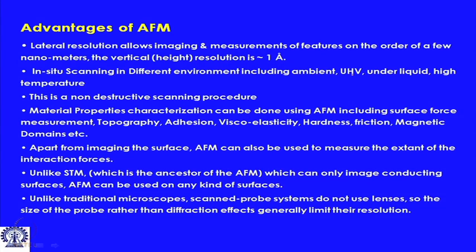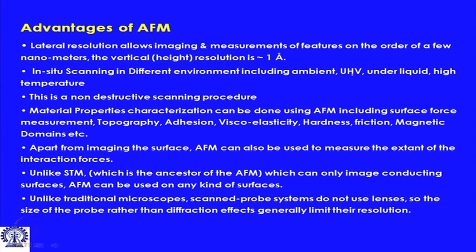You can have excellent atomic force microscope scans in ambient condition. You can also have scans under liquid, at high temperature, at low temperature, almost anything you want. That opens up an avenue for a whole lot of in situ imaging. This is a non-destructive scanning procedure, so you can look at your sample and then reuse it for any subsequent experiment or processing.